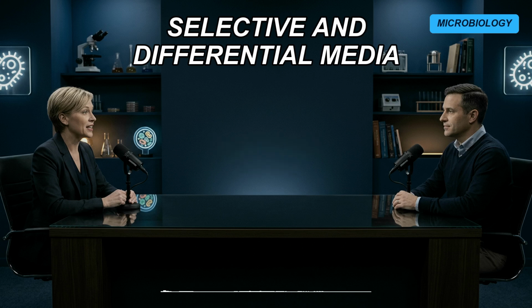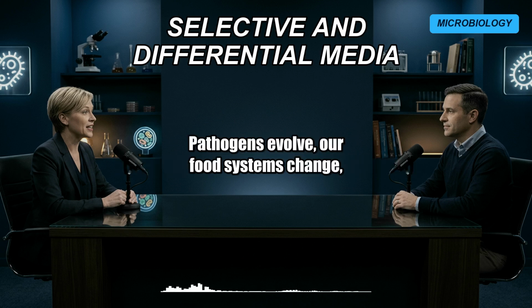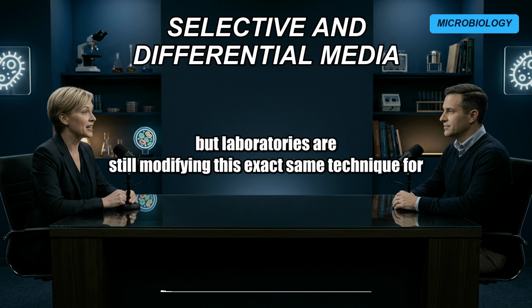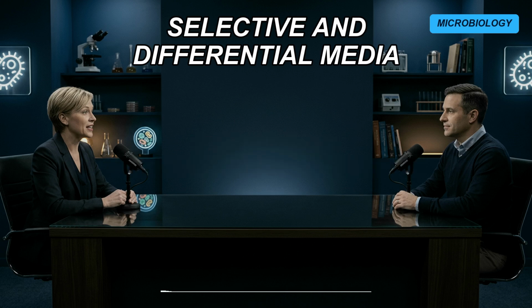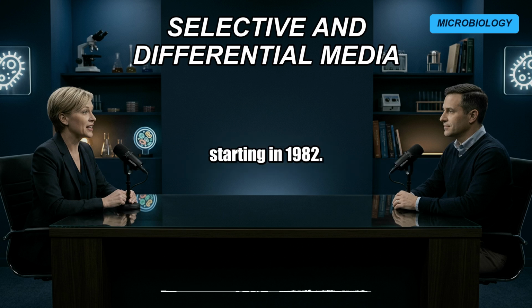That's wild. And the logic behind MacConkey's plate isn't just historical trivia. Pathogens evolve, our food systems change, but laboratories are still modifying this exact same technique for modern threats. I'm thinking specifically about the E. coli O157:H7 hamburger outbreaks that terrified the public starting in 1982.